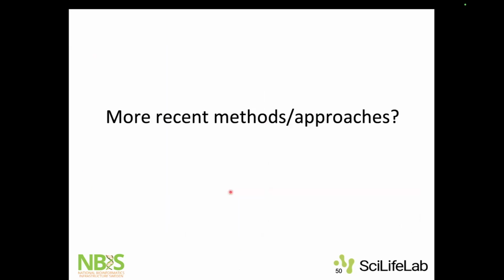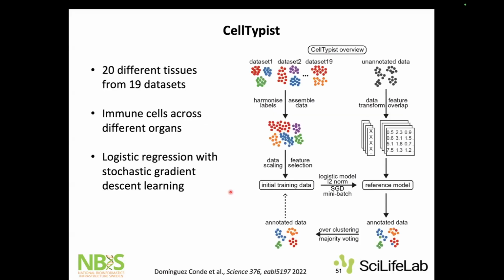So now we know the challenges about these methods. They vary based on the data set they have been trained on. That can also play a role: the train and test, how close they are, like are they trained on SmartSeq or trained on 10x, so how close they are. So we still have a lot of uncertainties, but there are more recent methods that came.